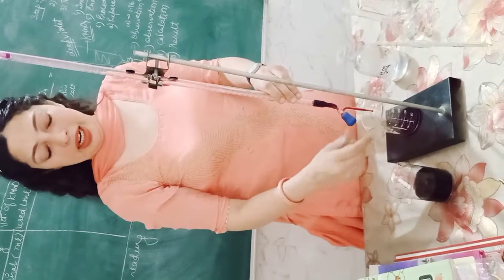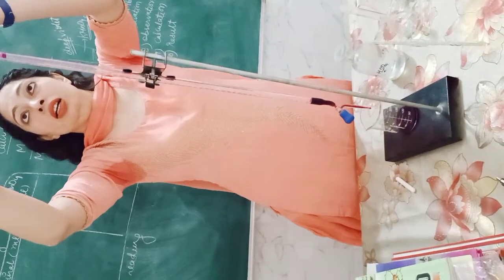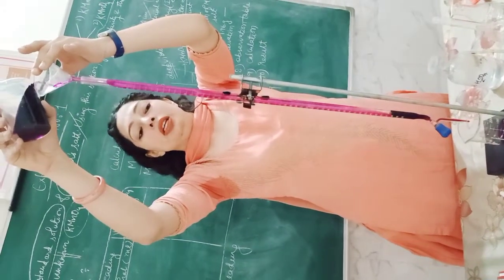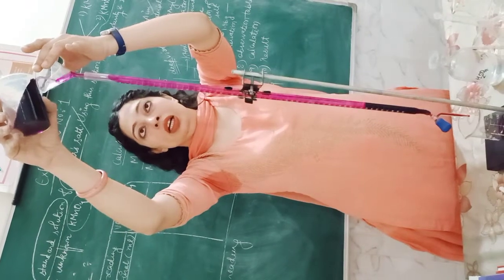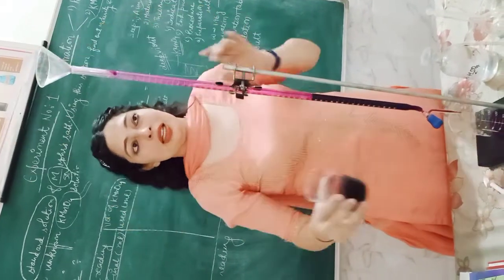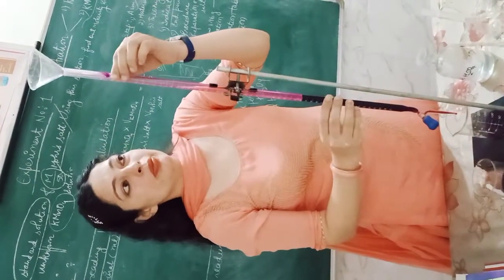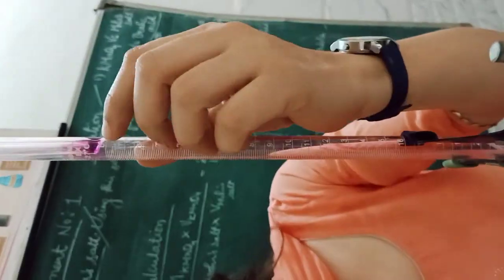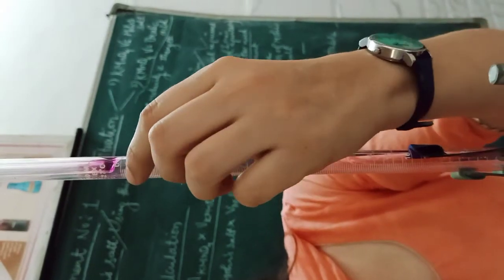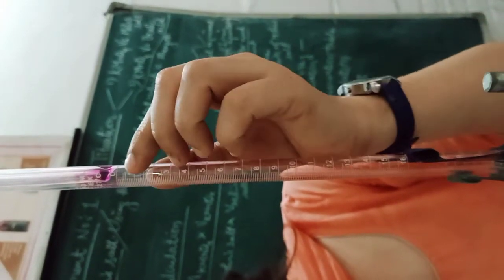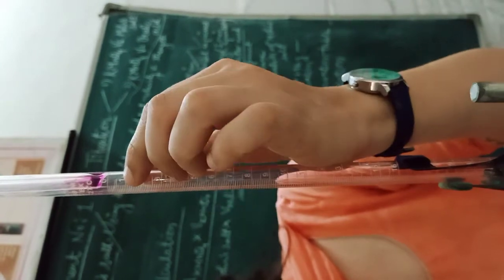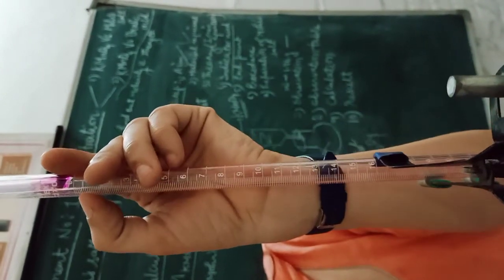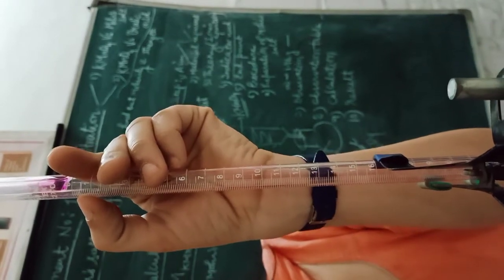When the rinsing is done, without the funnel, fill the dark violet color KMnO4 liquid into the burette. Here is zero — you start from zero. The scale is in milliliters. The big division indicates 0.5 ml, then 1 ml. The least count of this burette — the smallest division — is 0.1 ml.